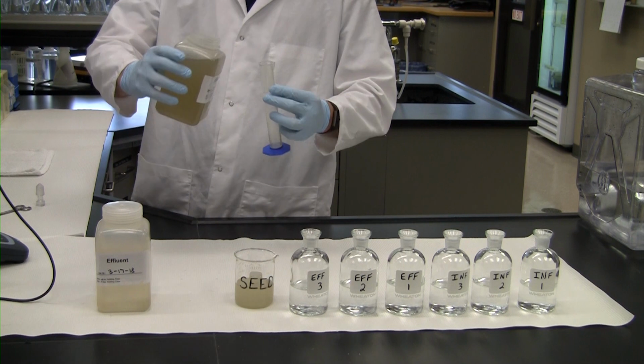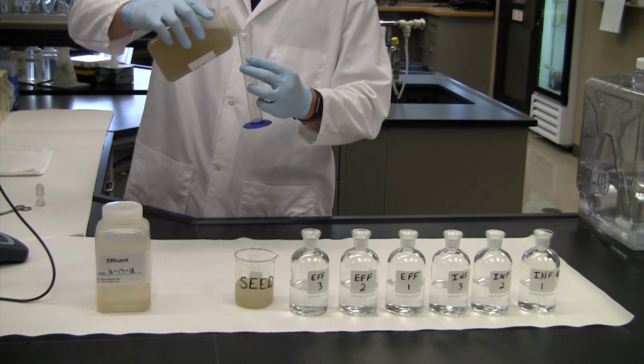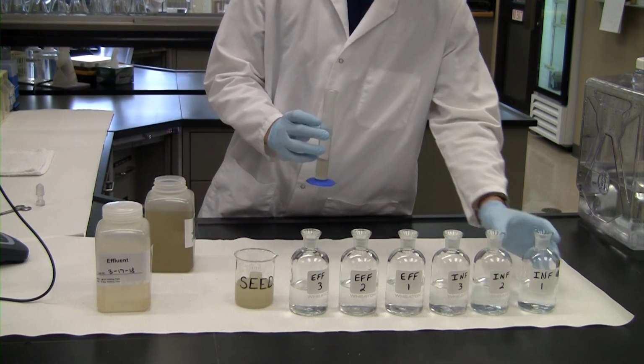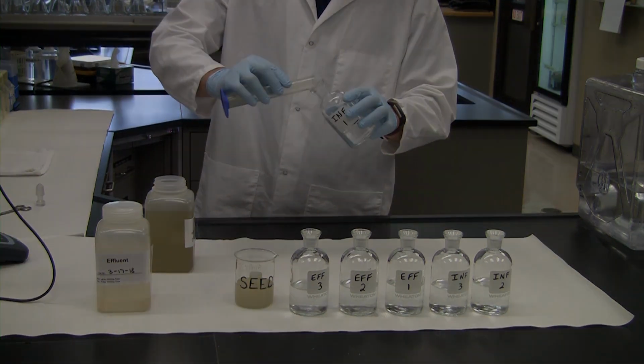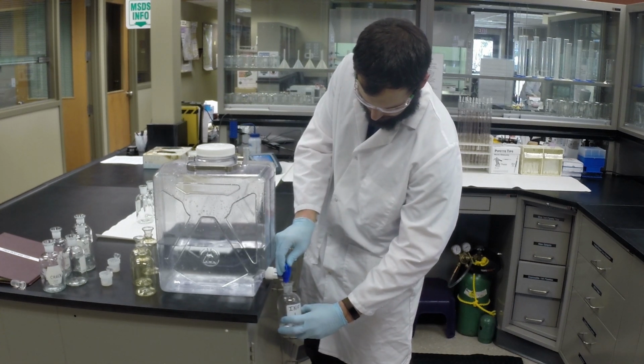You will need more sample volume for cleaner waters, for example, effluent, and less sample volume for stronger samples, for example, influent or industrial samples. 2 to 5 dilutions should be set up for each sample. Initial BOD setup. At this point, add dilution water to each bottle so that they are all about 1/3 full.